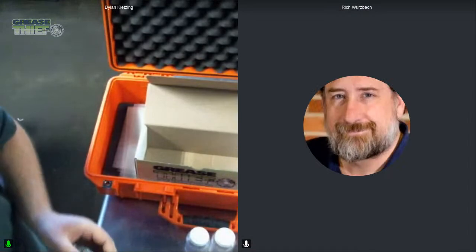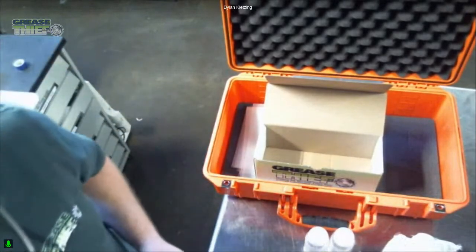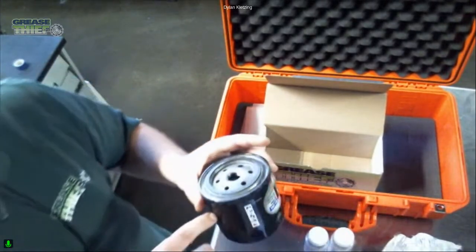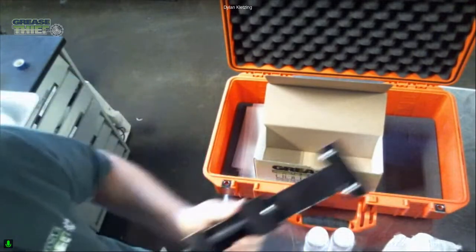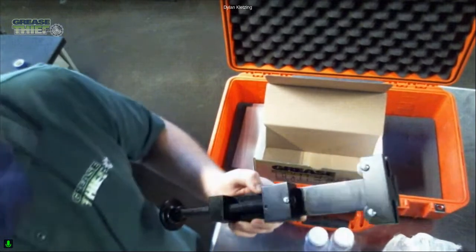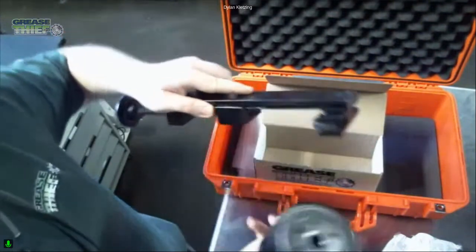I just wanted to show that, and then I also wanted to show what the inside of the filter looks like after it comes back. So we would get this filter into the lab, pour the oil off like normal, and then also inspect the inside of the filter to see what it looks like. We have our custom-made filter cutter here, which we can adjust for size. The filter is placed in there like this, and we can spin the filter around on these rollers and cut it.